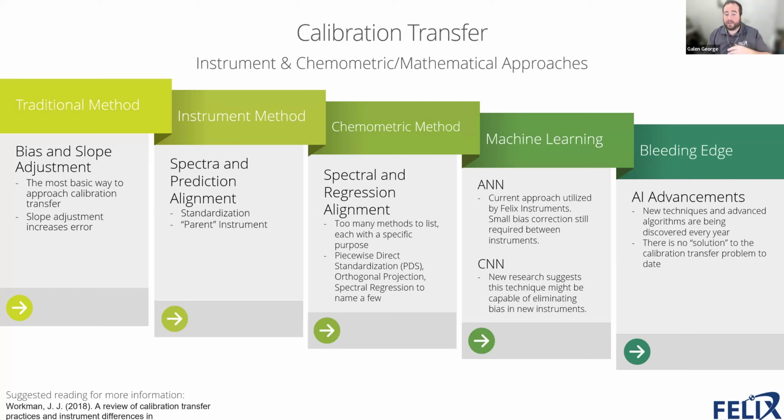This is typically done in development or even in QA after development. And this is also something that we do as a manufacturer. After we produce any new spectrometer, we always perform a test of some sort on a standardized target to ensure that our spectra looks the same as it has for all the other previous units that were built, essentially.